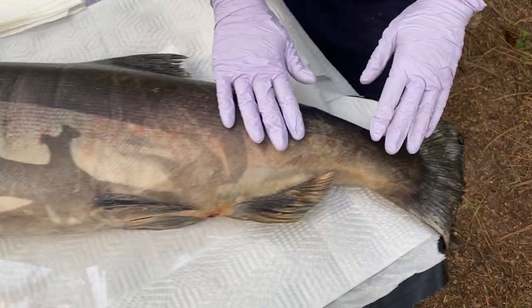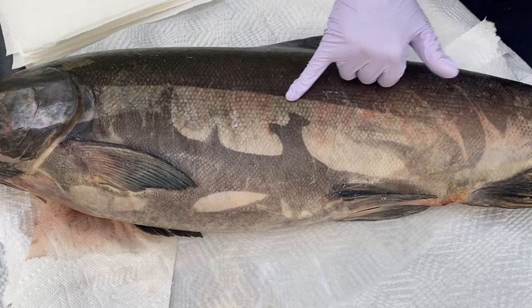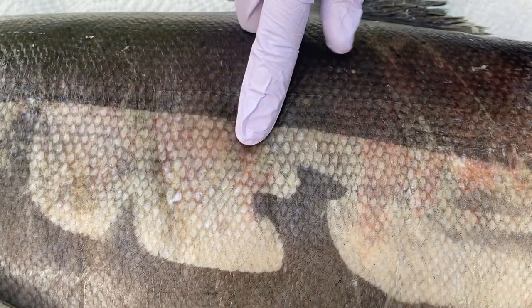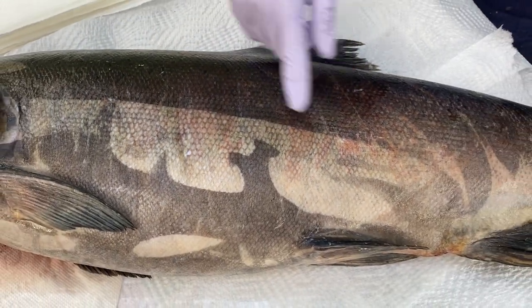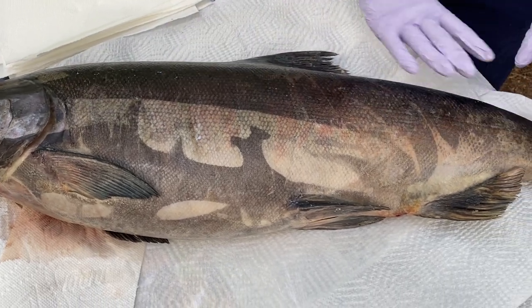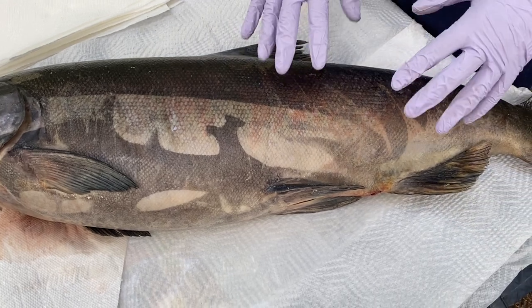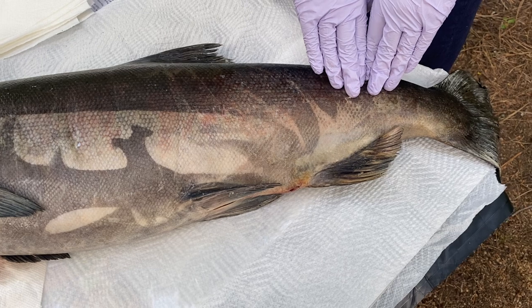And then we can see the skin of the salmon is really shiny, and you can see all these scales on it. So scales and slime have a special purpose too. The scales are like rings of a tree, and they grow more lines the older the salmon is. And they help protect the salmon. And then over the scales, they're going to have a layer of slime. And that slime has a purpose too. That slime is really good for getting out of the way of predators and being able to slide through the water really easily and quickly.